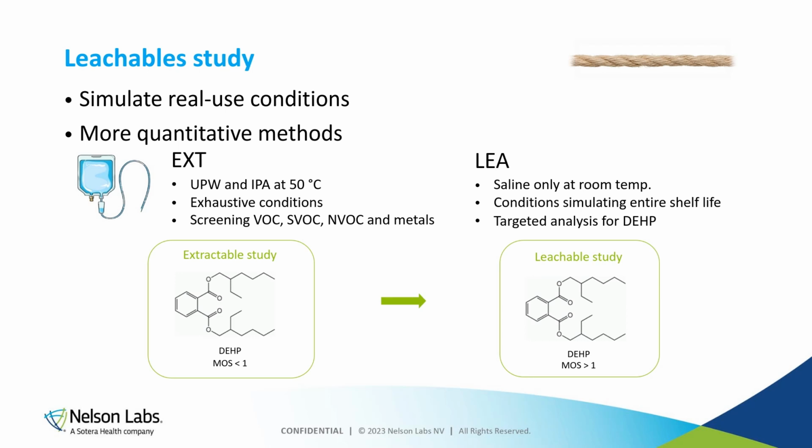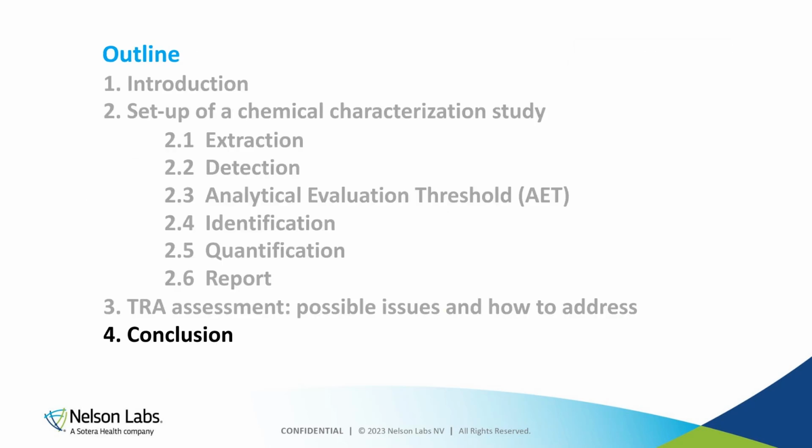And here you can see the concentration for this plasticizer, in that case, was at an acceptable level, with a margin of safety above 1. So under normal conditions, the exposure to this plasticizer didn't present a toxicological risk to the intended population. So as you can see here, there are possibilities to address extractable studies with too many extractables at too high concentrations from a tox risk perspective.